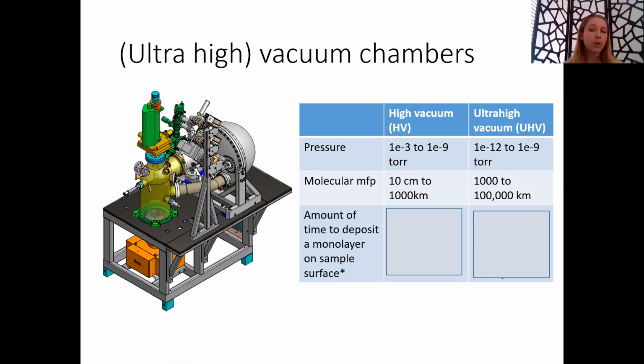But the more critical reason is the small electron mean free path that makes it only sensitive to the first couple of unit cells in a material. If you have poorer vacuum, you'll have atoms absorbing or sticking onto the surface. Once they create a monolayer, that is another layer of atoms that photoelectrons need to go through before they can be photoemitted.